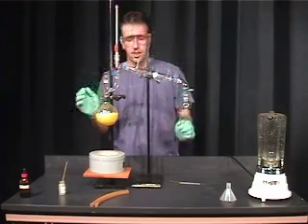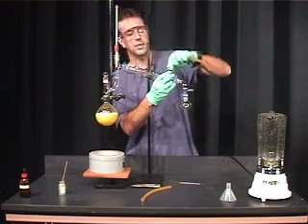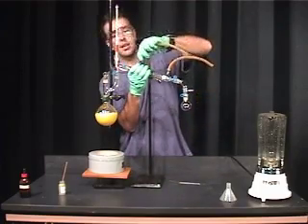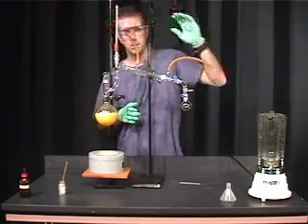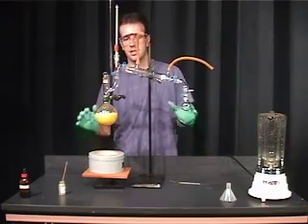Once this is complete, we can add in our tubing. The water inlet goes in at the bottom, and the water outlet towards the drain goes out at the top. Now the glassware assembly for a steam distillation is complete.